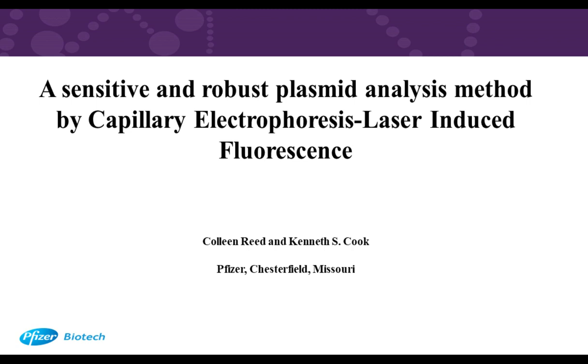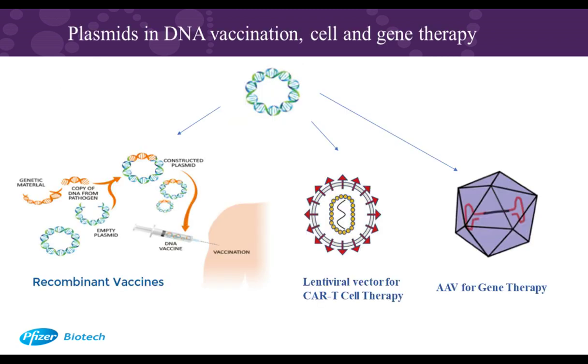Thank you very much for the great introduction. Hello, everybody. I'm going to talk about the development of a sensitive and robust plasmid analysis method by capillary electrophoresis, laser-induced fluorescence.